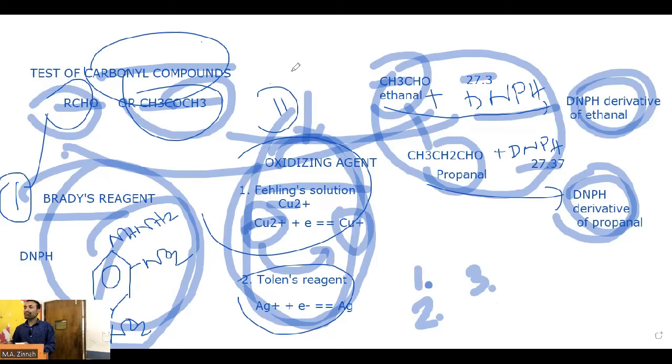Them, এই them নিয়ে একটা কথা আছে, সেটা হচ্ছে them you mean আমরা তো melting point determine করলাম এর, right? Air melting point determine করেছি. So we are supposed to identify this compound, right? With a melting point, we are supposed to identify this compound with a melting point.